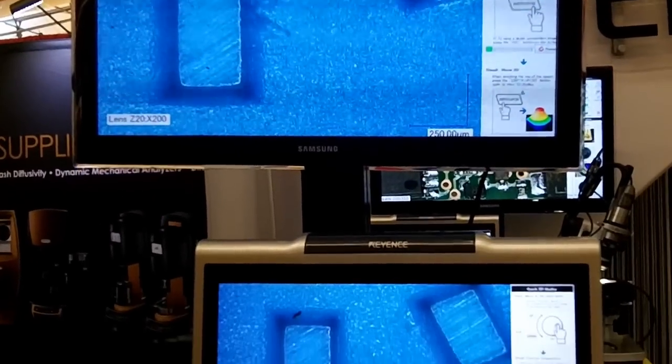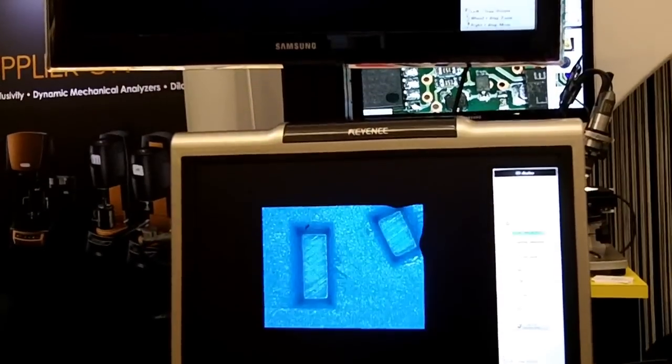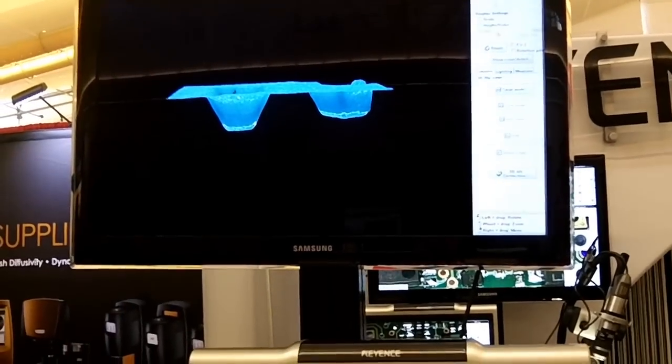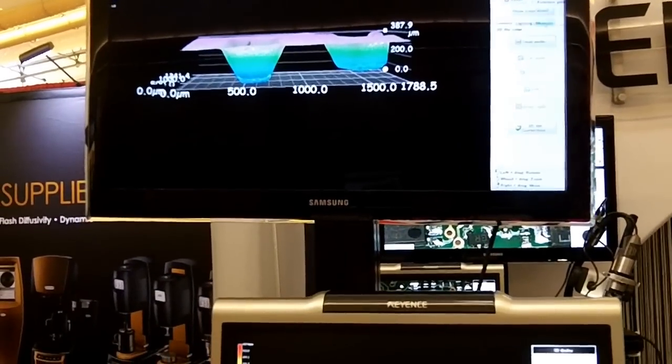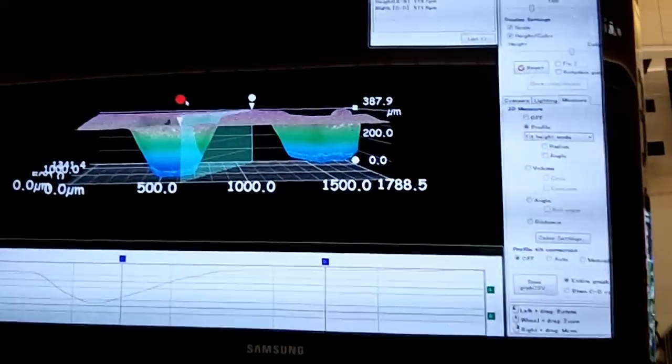Great. And so we can push this button one more time, and we can take this composite image and turn it into a three-dimensional model. So we're trying to get a better understanding of the surface shape. We can also measure on it as well, profile, volume, anything like that.